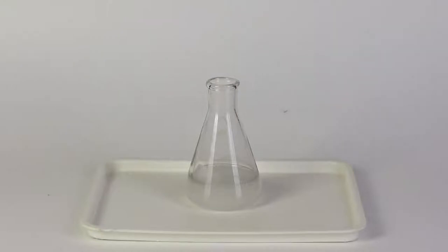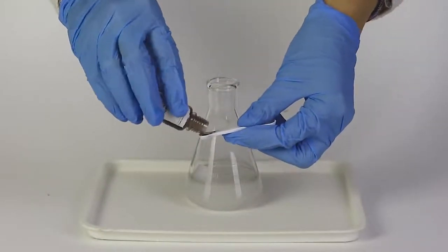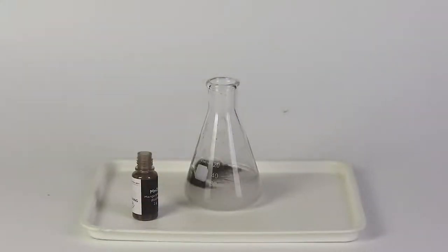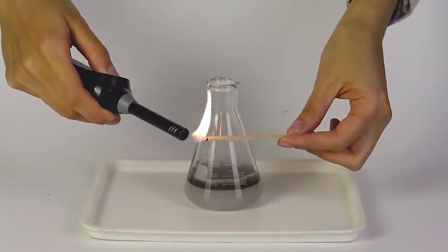Now remove the funnel and add one small measuring spoon of manganese dioxide to it. As soon as the manganese dioxide is added, the hydrogen peroxide starts to actively decompose into water and oxygen. This makes the reaction mixture bubble. The manganese dioxide acts as a catalyst for the decomposition of hydrogen peroxide.